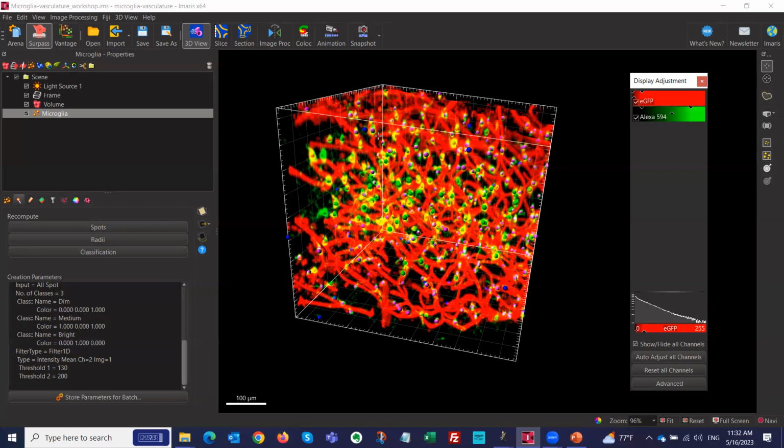And then I will talk a little bit more in detail about colocalization. And I want to finish this up with a filament tracing example about all the new features that came in Imaris 10, how filament tracing is faster and better now than before. And this should probably get us right at the 2 p.m. mark, okay?